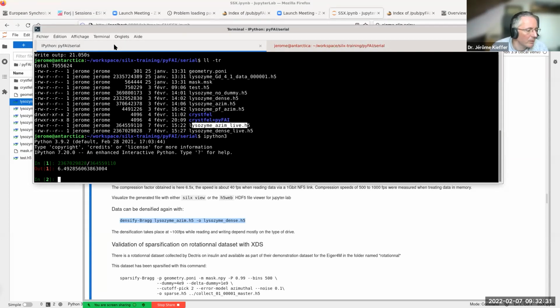I performed the calibration of all Eiger detectors that were delivered two years back at ESRF, and we have the procedure with a grid of holes. I characterized them. We received the 3 or 4 Eiger 4M, and the procedures are ready. It's not yet done for the Jungfrau, but it's something we'll have to do.